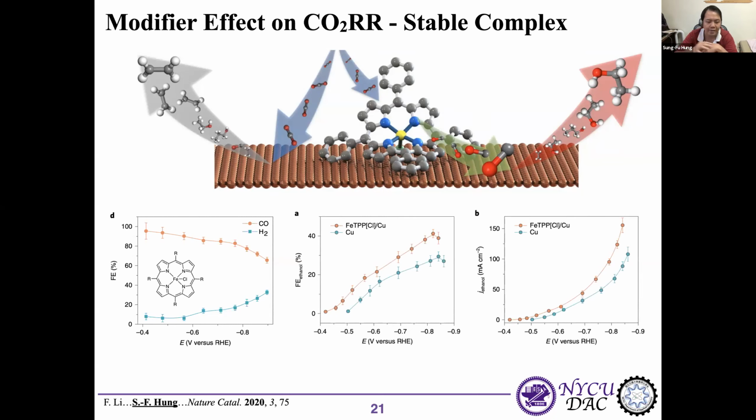Okay, so the ethanol faradaic efficiency of the composite catalyst was higher than the pure copper electrode across the entire applied potential range, and achieved a peak value of 41%. In contrast, the peak ethanol faradaic efficiency for the pure copper was only 29%.